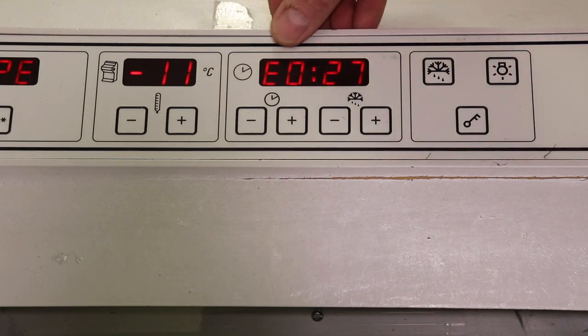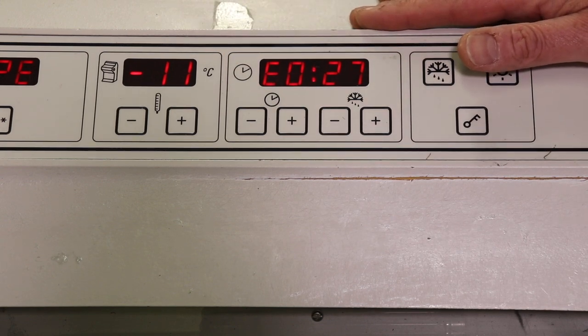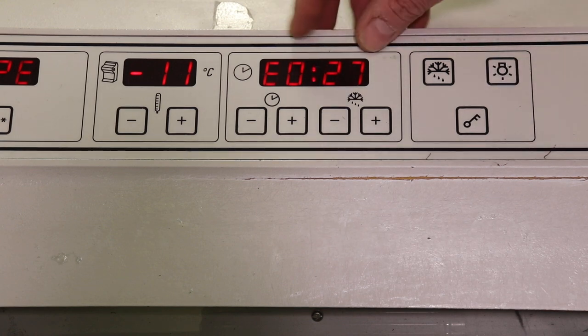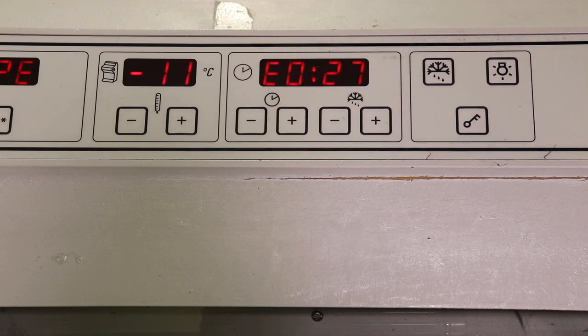So the problem is this E27 in the display where your time would normally be. You'll also start to notice ice building up on the coils above the microtome in the chamber. As long as this error is here, you will never get a full defrost out of this machine. The cause of it is a temperature sensor in the back of the machine buried in the refrigeration system — buried in such a way that you just really will never be able to get to it yourself.